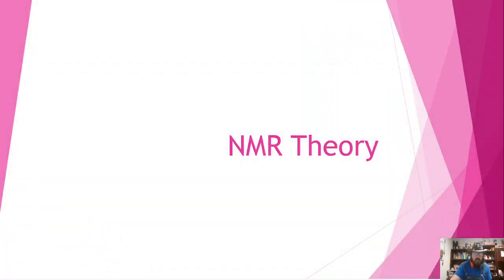So, I don't have the slides posted online. The notes are maybe not going to fit as closely to what we're going to talk about, but we will be going through the theory of how NMR is technically supposed to work. So, once again, this was for my organic spectroscopy course.